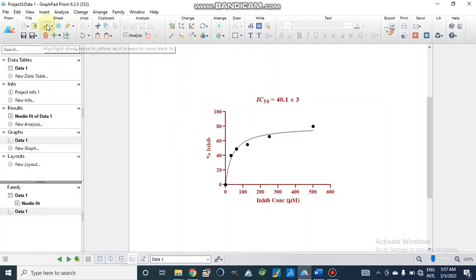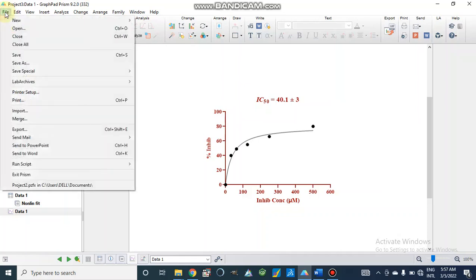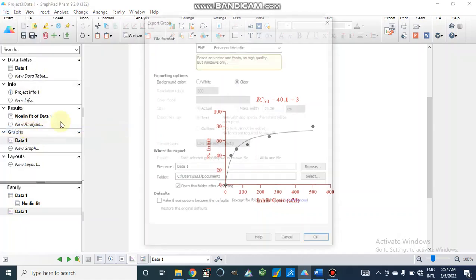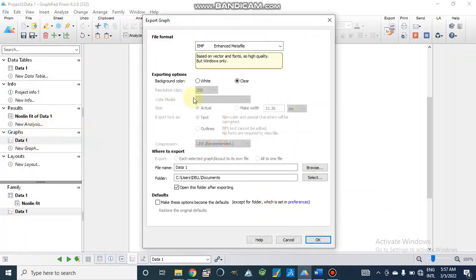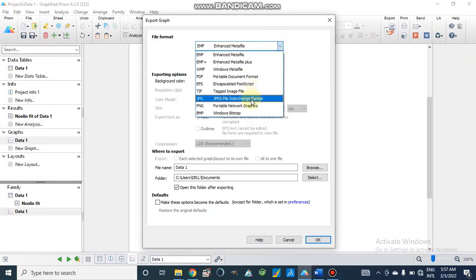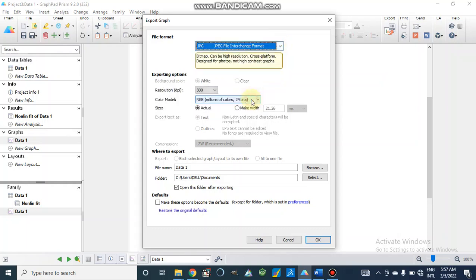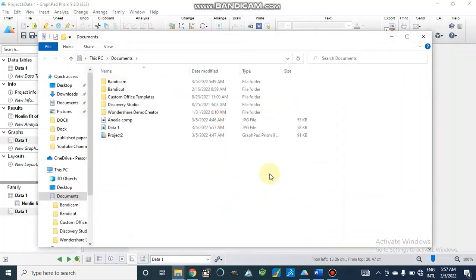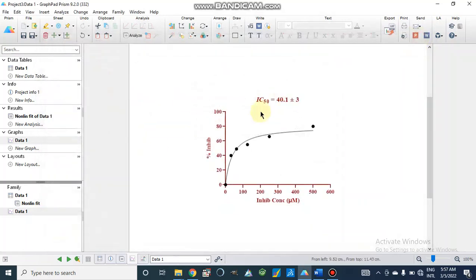When we are going to save this file we will go to File and Export. Here we can select our file, JPG or any format, where we want to save the export. And now this will be saved like this.